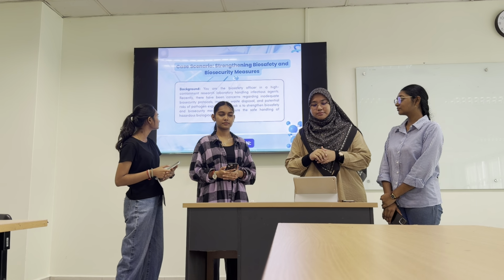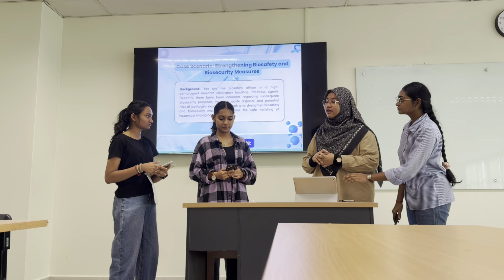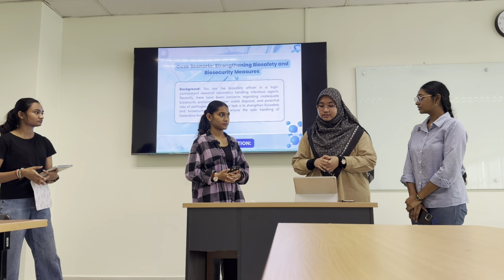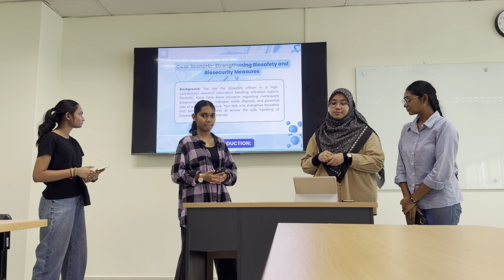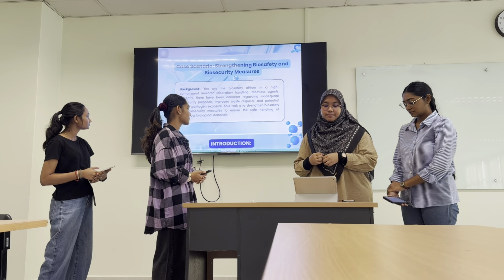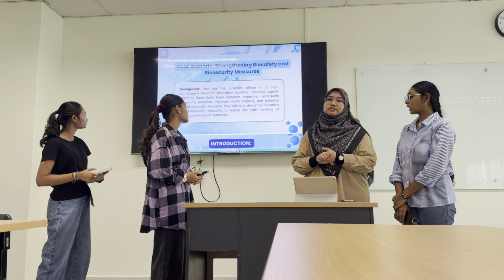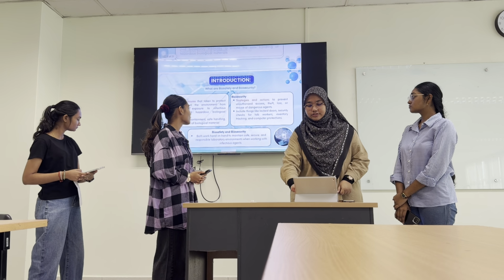Officer in a high containment research laboratory handling infectious agents. Recently, there have been concerns regarding inadequate biosecurity protocols, improper waste disposal, and potential risk of pathogen exposure. Our task is to strengthen biosafety and biosecurity measures to ensure the safe handling of hazardous biological materials. So we move on to the introduction.